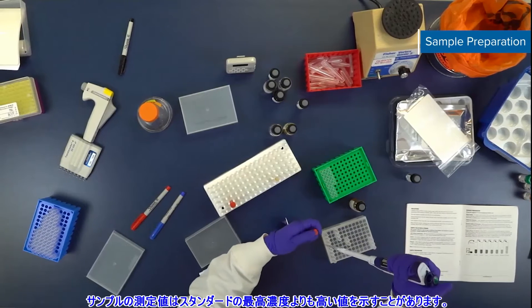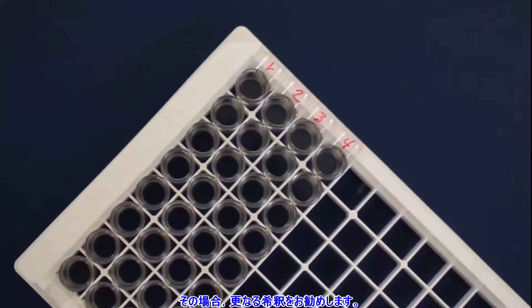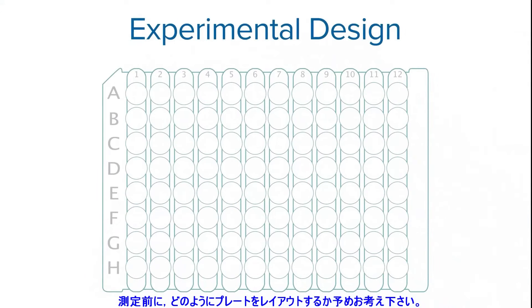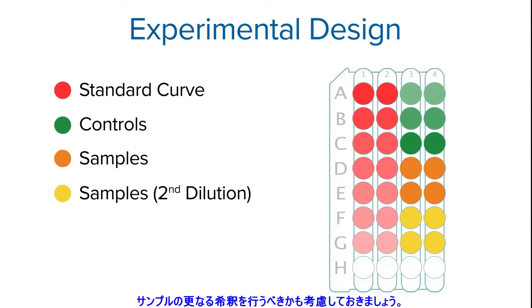Sometimes the sample will read higher than the highest standard, therefore an additional dilution to a lower concentration is recommended. If you haven't done so already, take some time to think about how you'll set up your plate. In our plate, the standard curve will be set up in duplicate in strips 1 and 2, and our controls and samples in duplicate in strips 3 and 4. Here's where you can consider running additional dilutions of your samples.